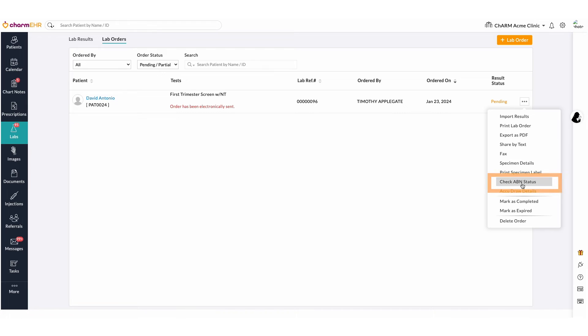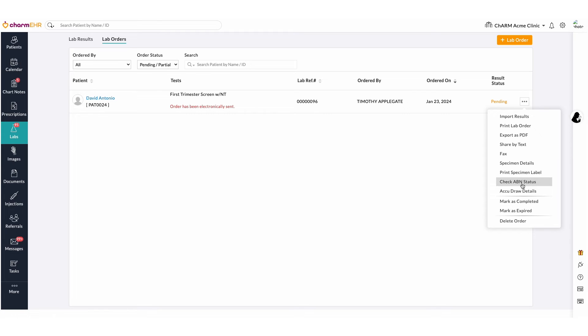Check ABN Status. The Check ABN Status function assesses the Advanced Beneficiary Notice information for the tests, if it is accessible. An ABN is a written notice that a Medicare patient may receive from a physician, provider, or supplier, when there is a reason to believe that Medicare will not likely pay for an item or service. The ABN assists a Medicare patient in making an informed choice about whether or not to receive the services, knowing he or she may be responsible for the payment.